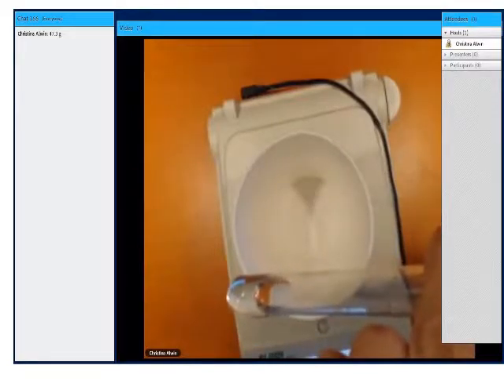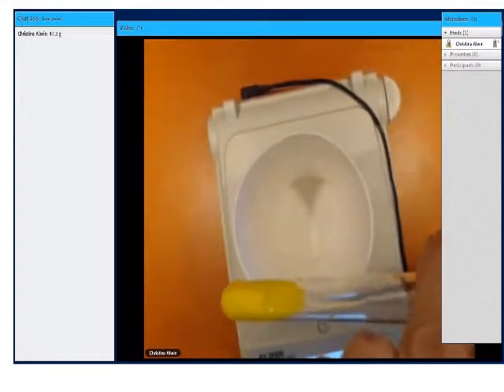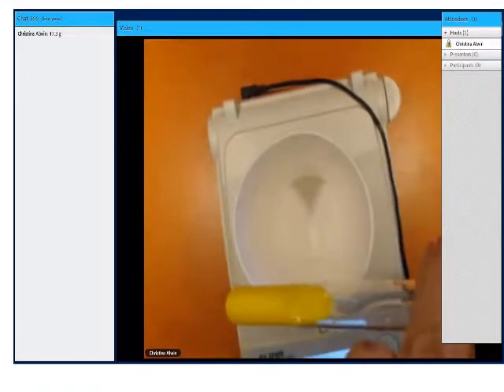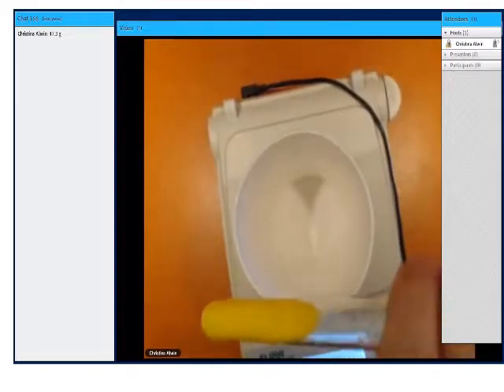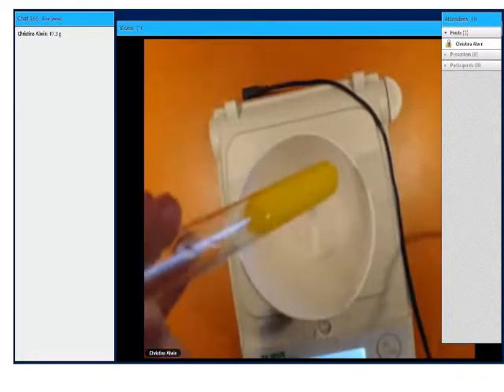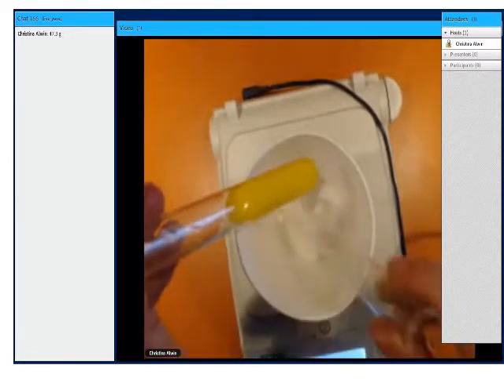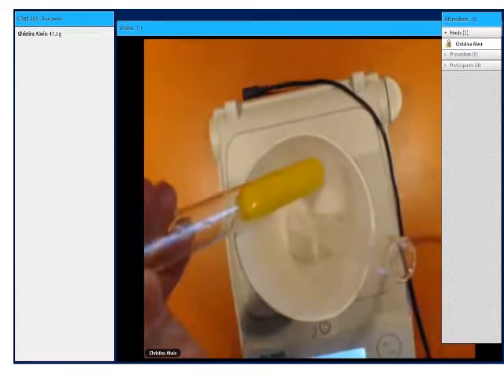Pouring. There it goes. Look at that. So I'm pouring these two together, and look what I get. Think about some signs that you have seen of a chemical change. Clearly, you got a color change.